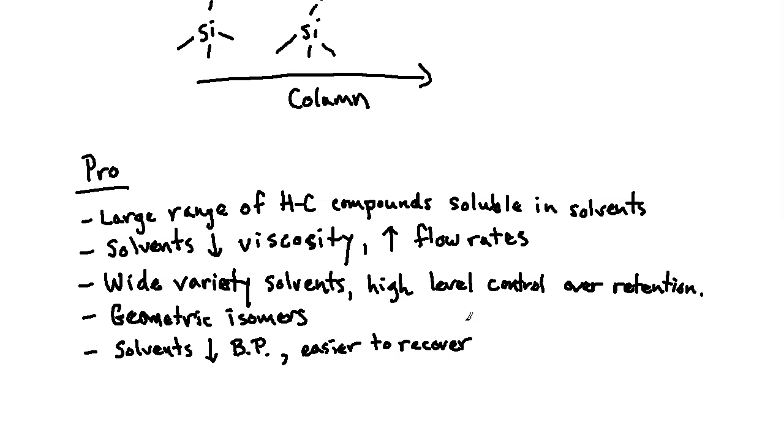Okay, so there are various devices. For instance, when I was in graduate school, this was on the benchtop level. We would use things called rotovaps, and they were basically round bottom flasks that would sit in a water bath, and you would set it to a very low or mild temperature. You'd pull a vacuum, and then it would remove the solvent system you were utilizing away from the analyte or the compound or the product, and then recondense it over a cold column with some antifreeze running through it, right? Chilling it down, some chilling solution, and then you could recover your solvent.